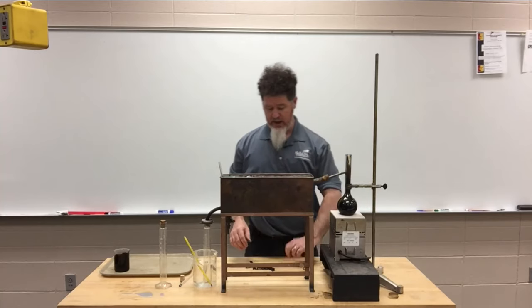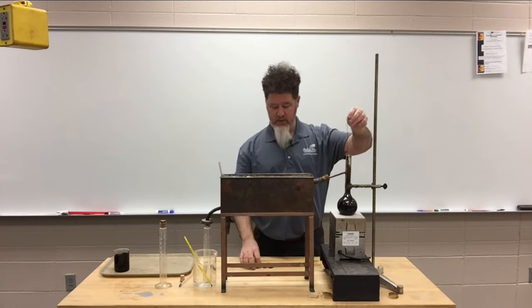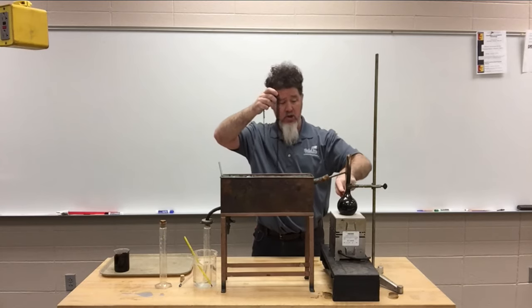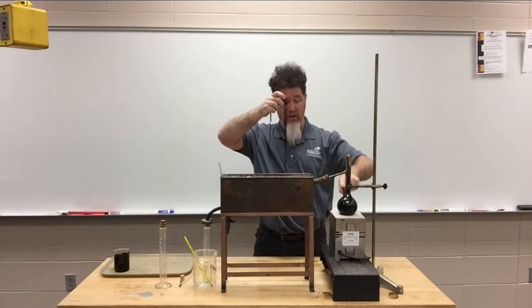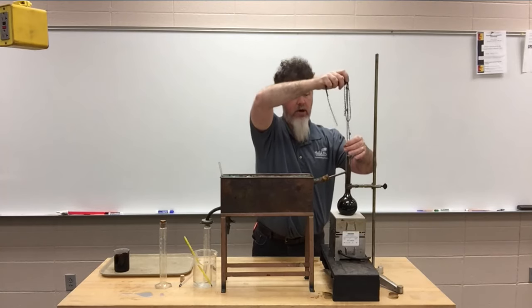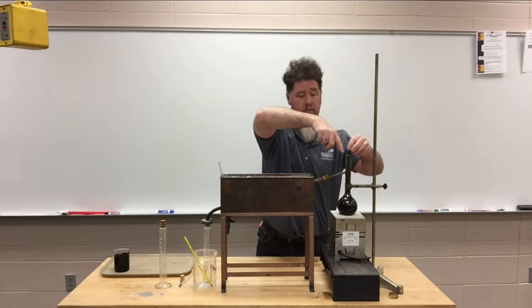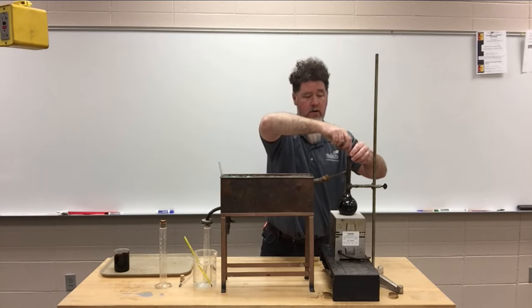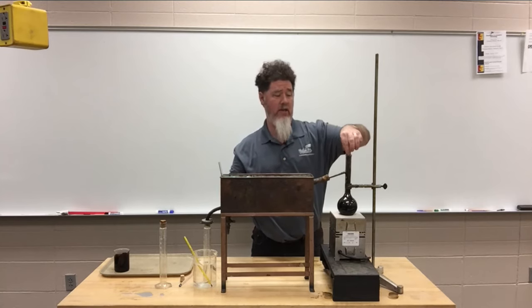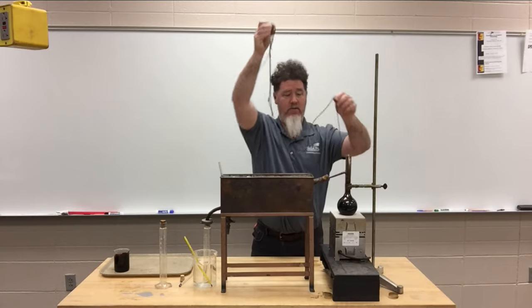So, okay, what I am going to do next is put a little piece of wire that we fabricated. I'm going to put this jack chain in here, and the jack chain starts right here in the tower of the flask, not down where the oil is boiling. This helps the oil condense and vaporize when it comes up in this taller area here. I've got two different chains, and that chain is too long. Let me go get my shorter chain. I'll be back.